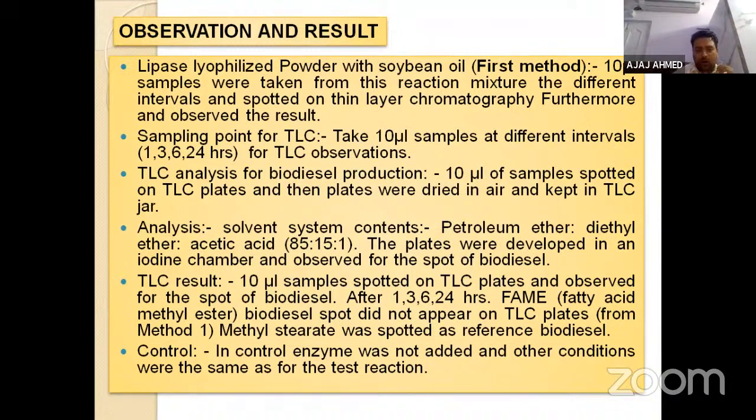In the TLC results, we observed for biodiesel after 1 hour, 3 hours, 6 hours, and 24 hours. The fatty acid methyl ester, biodiesel spot did not appear on the TLC plates from the first method. Methyl stearate was spotted as a reference biodiesel. Methyl stearate is a fatty acid methyl ester, a standard methyl ester.